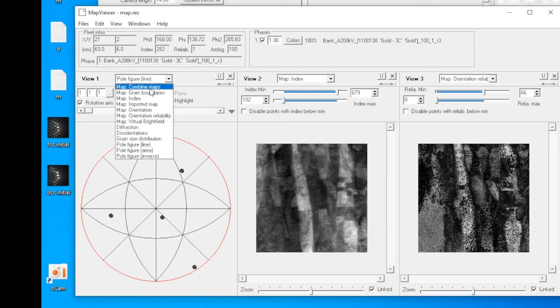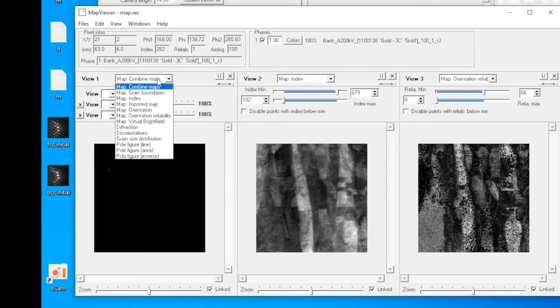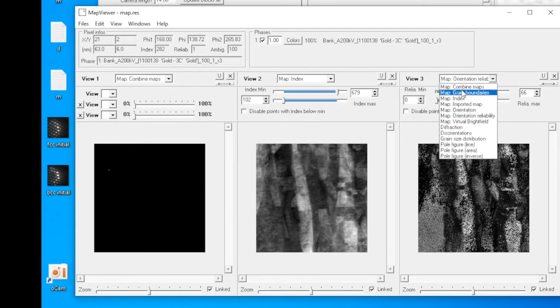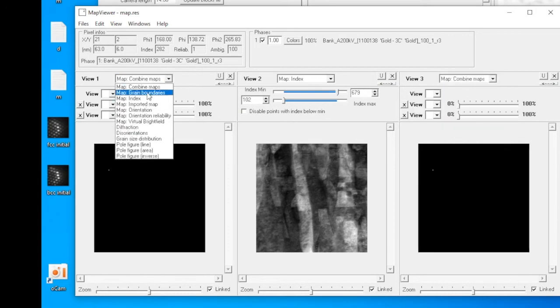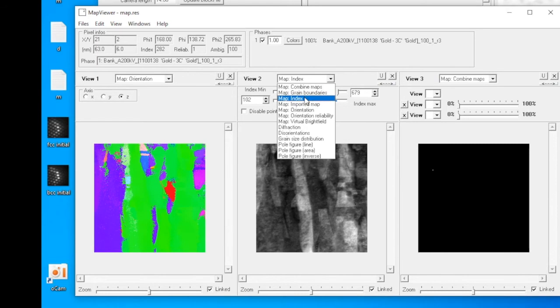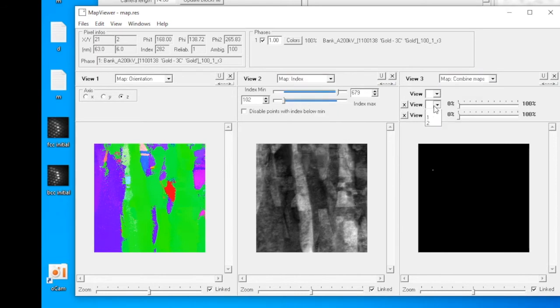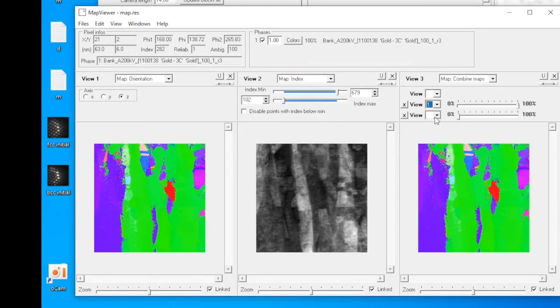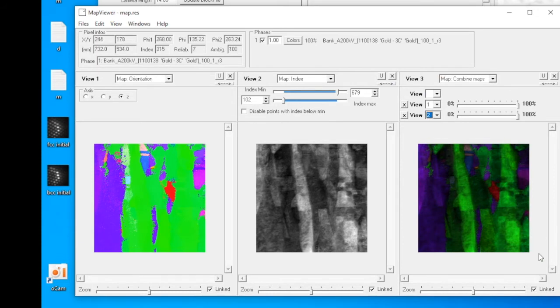Let's go back to the very first option, combined maps. Let's make the first viewing window the orientation map, and leave the second viewing window the index map. Then generate the combined maps. You can see the combined map displays both the orientation information as well as the index map information.